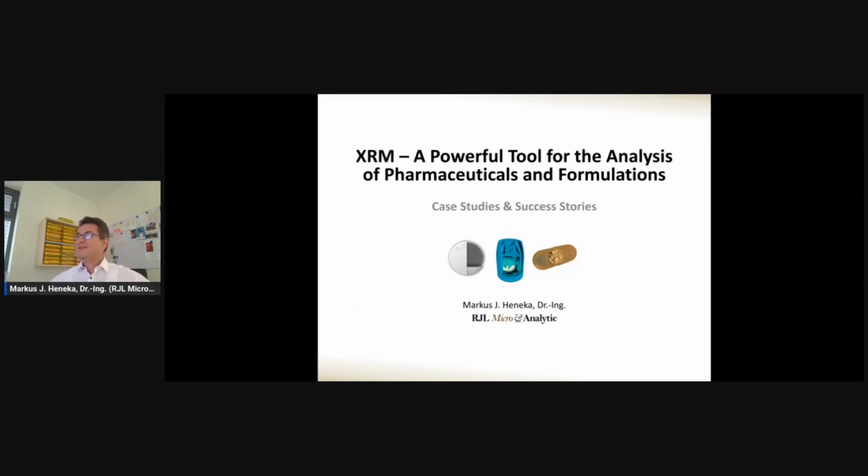Obviously, yes. So I'm going to present about X-ray microscopy, XRM, which is, in my opinion, a powerful tool for the analysis of pharmaceuticals and formulations. I'm going to show you some case studies and success stories. And first, I'm going to introduce myself.